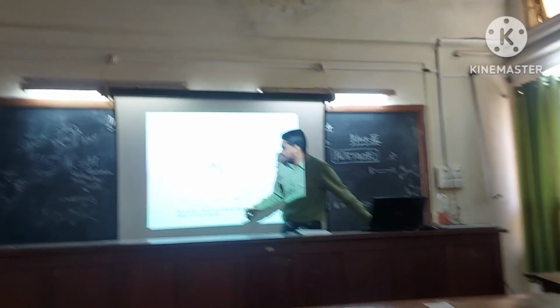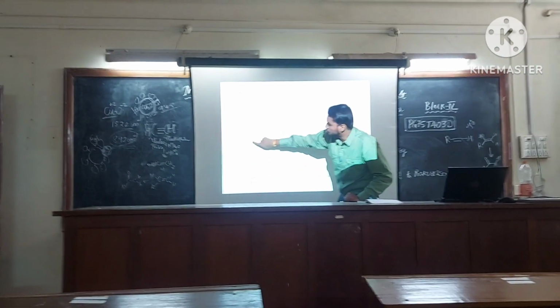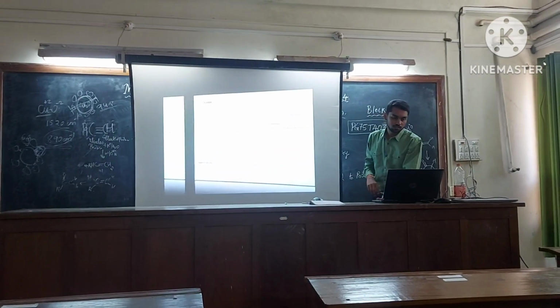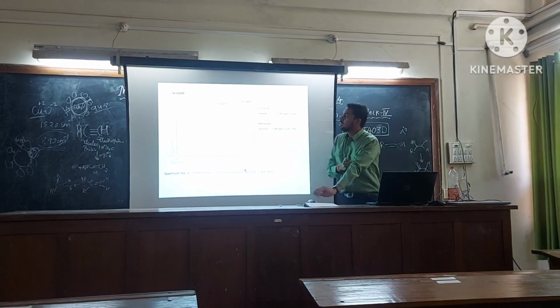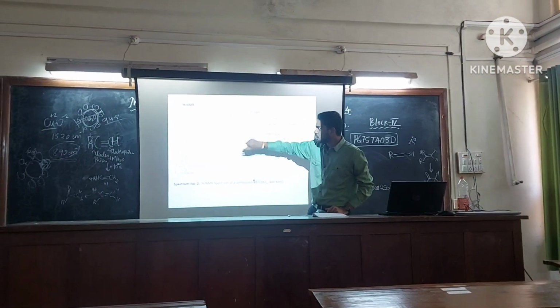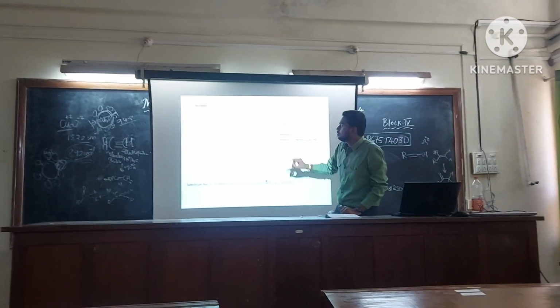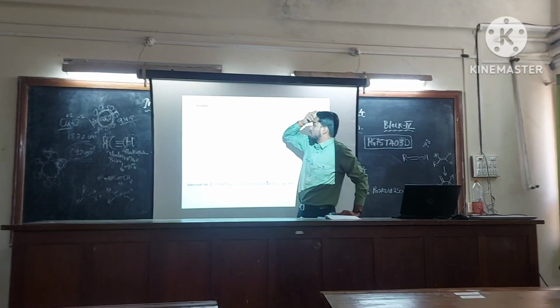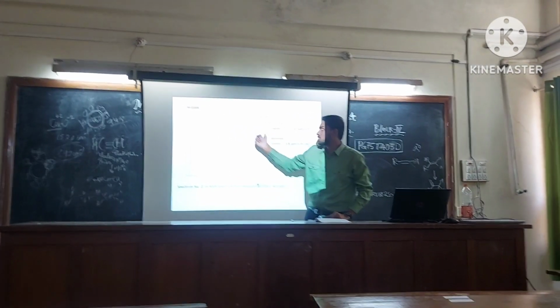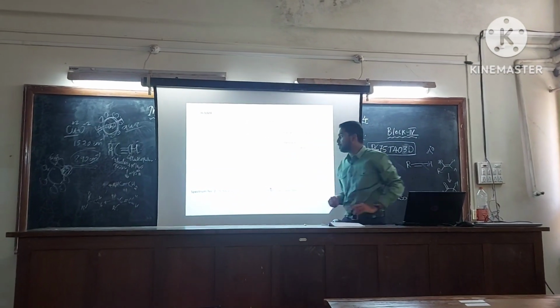If I look at the peaks, for FTIR we obtained three peaks. The next step is the proton NMR. I am concentrating on two major peaks: one is the methylene proton and the other is the C5 proton of the triazole. The methylene proton resonated at 5.56 ppm, and the triazole C5 proton resonated at 7.65 ppm.